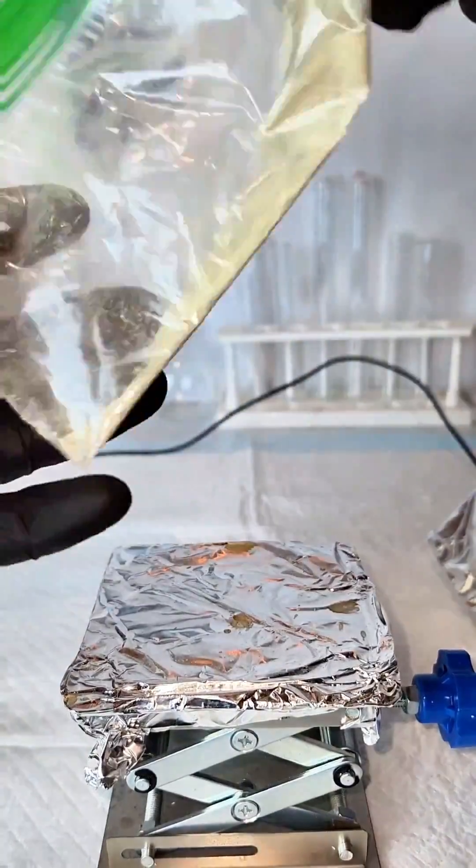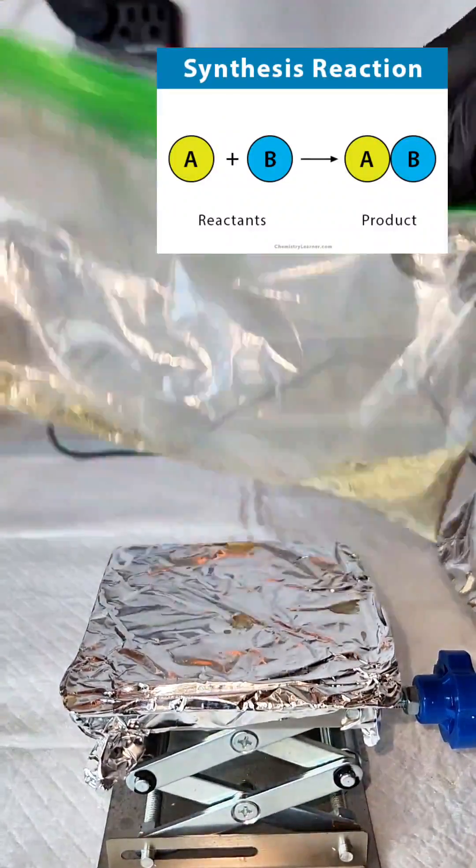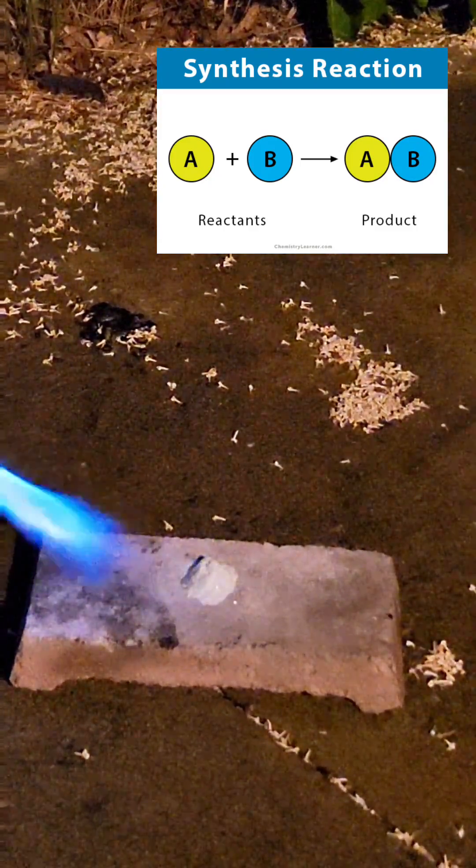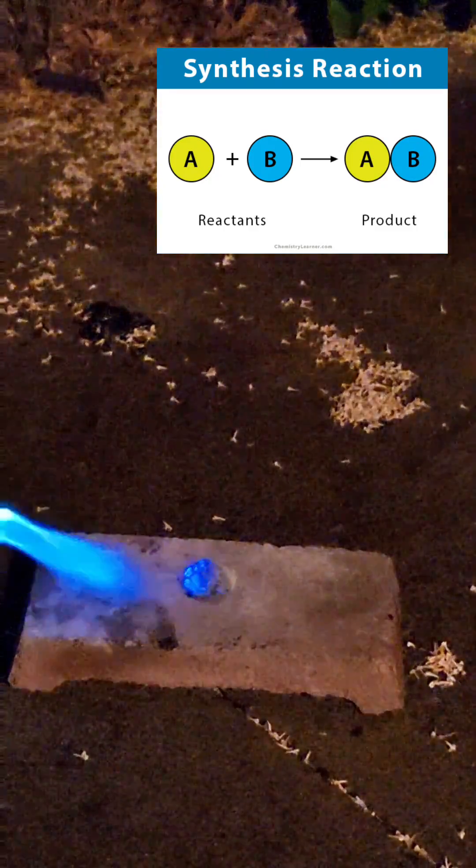I think this is a really good example of a synthesis reaction, which is one of the core types of chemical reactions. This process can actually be used to make a variety of metal sulfides, but zinc sulfide has a very unique property that I'll show you in a second.